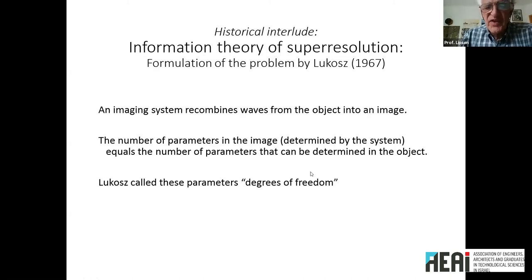So now you've seen what we are doing here. We've said that we waste light, and we have to see how this improves the resolution. This problem was attacked by Lukosz in 1967, a long time ago. I'll just show you this. This is a little bit of mathematics to keep you awake or put you to sleep, whatever. The imaging system recombines the waves which are diffracted by the object into an image. That's what it does. Now, the number of parameters in the image cannot be greater than the number of parameters in the object.